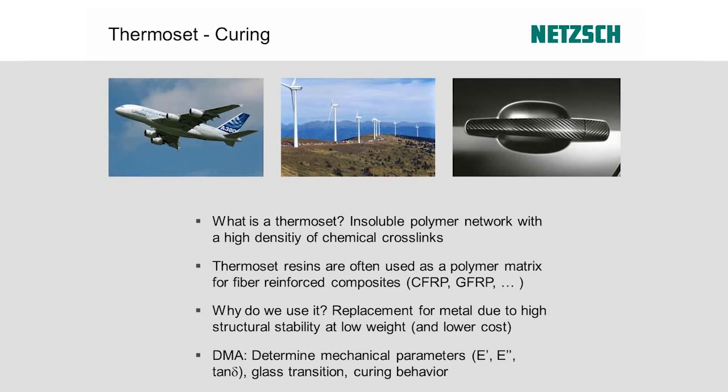We know already we can determine mechanical parameters. We can measure the stiffness at a certain temperature. We can measure the loss modulus and the damping. We can also measure the glass transition to determine the application range. And we can look at curing behavior.